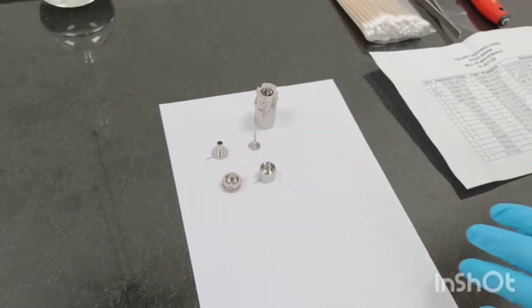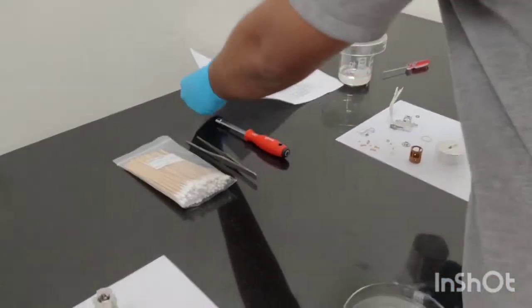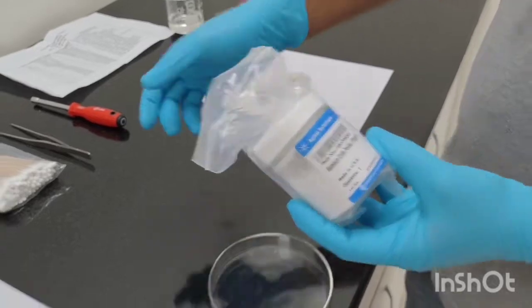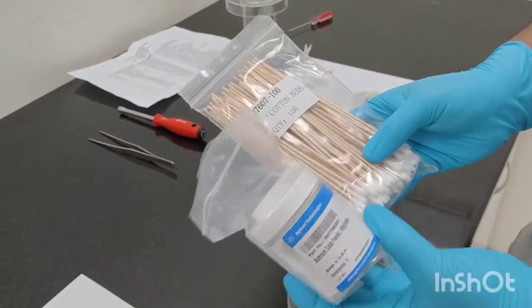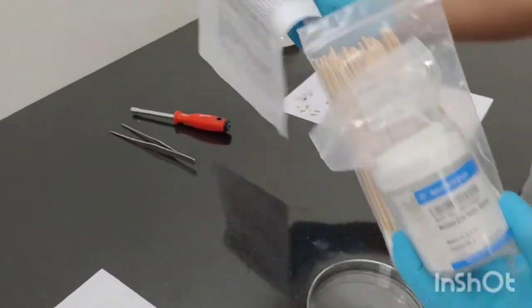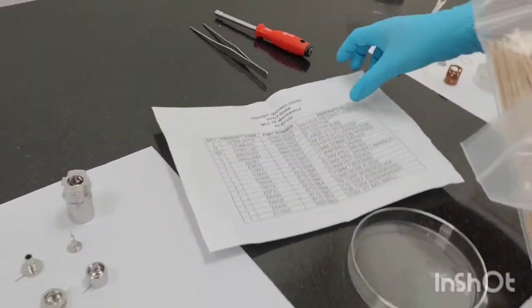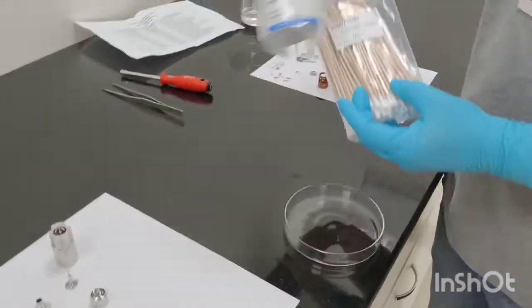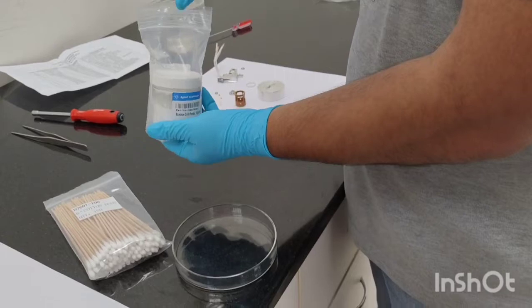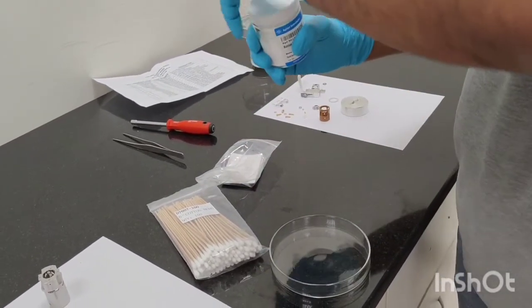Now what we need is this aluminum oxide powder for cleaning the ion source. We also need cotton buds — this cotton bud is also present in the GCMS toolkit, cotton buds are there in a quantity of 100. We are using this from our toolkit, and this aluminum oxide powder also comes with the new GCMS.